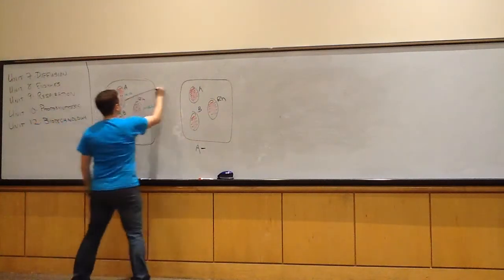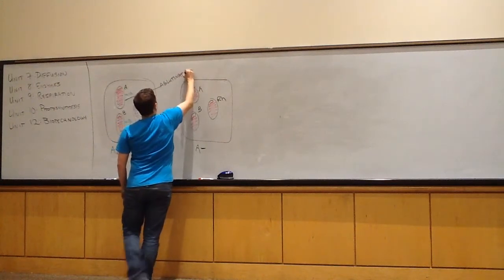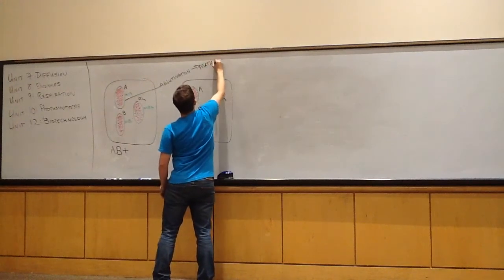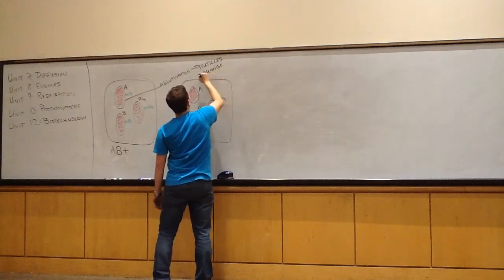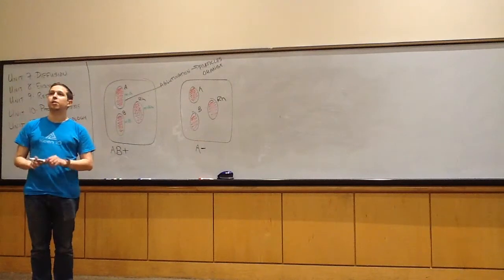Now, the one final thing I want to leave you with is sometimes agglutination doesn't look like particulates. So agglutination either means particles, or it can also sometimes mean that you see an orangish color. You need to see what I mean. Look on the website, on those pictures I have, and you can actually see the color change that much.